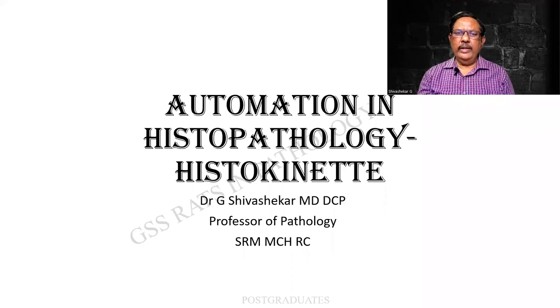The class for today is Automation in Histopathology, and the component I shall be dealing with is Histokinette. This has been a repeatedly asked university question, and even otherwise, it will hamper us a lot if we do not answer this fluently in our viva at the practical.